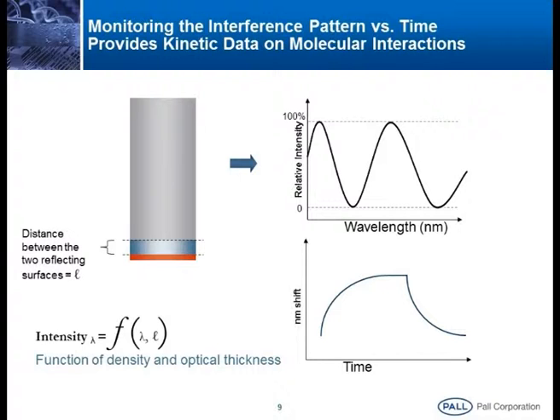When we say kinetics, most people do label-based platform studies like ITC, or ELISA-based methods, but all the other methods only give affinity constants. Suppose I plot a sigmoid like this, at the midpoint, the IC50, what we call affinity.